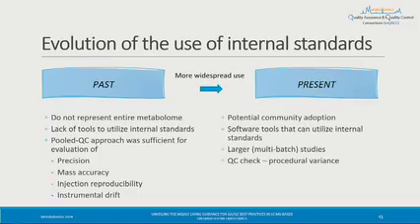But if you look more recently, I think we can see more widespread use, especially in the lipidomics community, but also increasing in the metabolomics community. And there are some really nice tools emerging, for example from different vendors, that can also monitor internal standard performance on the fly and flag any issues with the run. So I think this field is really evolving. We are also finding that use of internal standards is really important for larger and multi-batch studies.